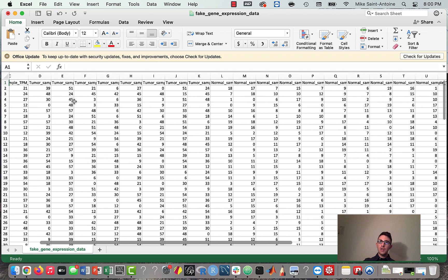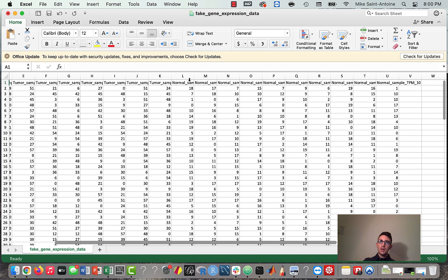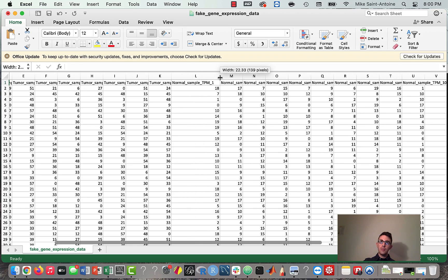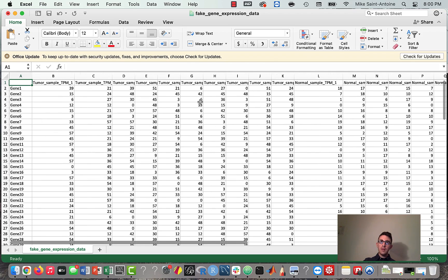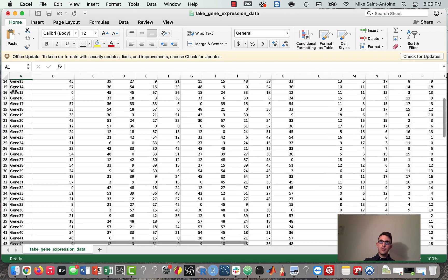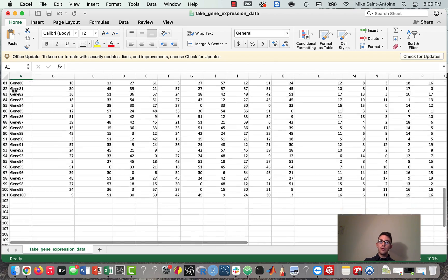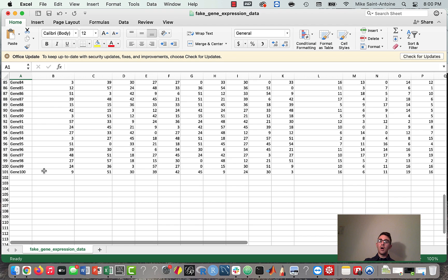We have 10 tumor samples just numbered one to 10, and also 10 normal samples, and then we have genes one to 100.